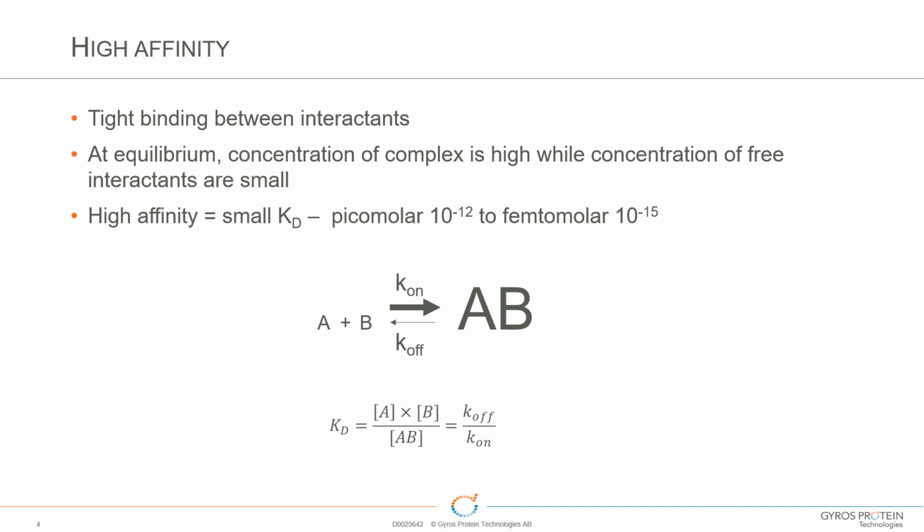Yeah, which is conceptually the wrong way around for me. Yeah, it's a bit counterintuitive, but again, it's all about that off rate, right? So you have to let things settle, and I think about it like things settling, coming to some sort of equilibrium, and you just have to wait for that off rate to occur before we establish that real equilibrium.